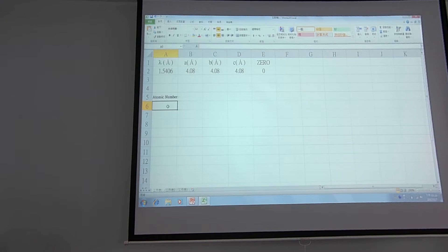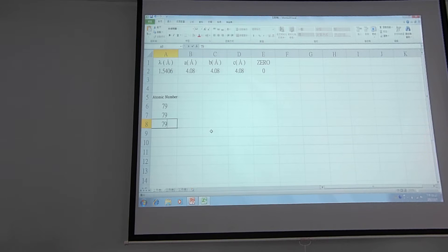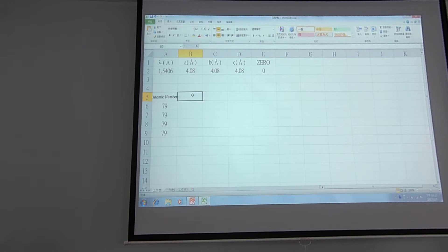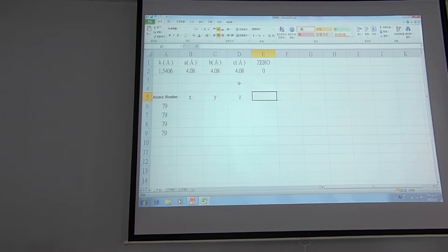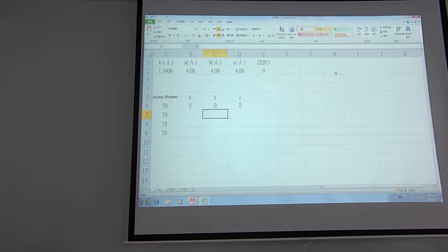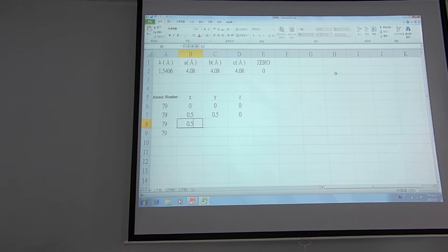We know the atomic number of gold is 79, so we will type 79 in each of the four cells. Then we need to know the atom positions inside the unit cell, so we set up the coordinates x, y, and z. We know the FCC positions occupy four sites: (0,0,0), (0,½,½), (½,0,½), and (½,½,0).